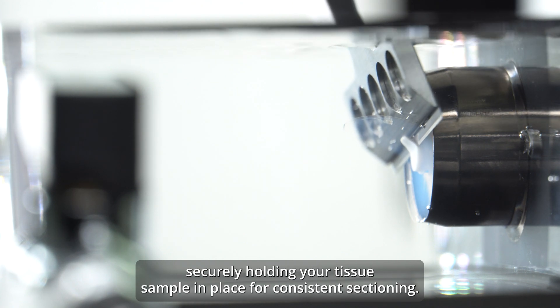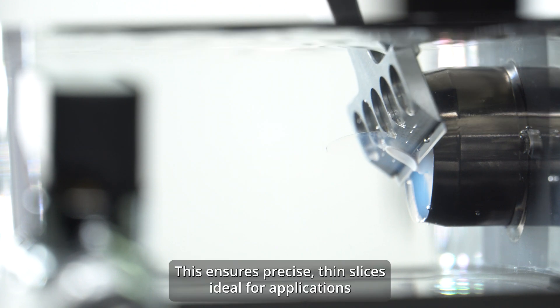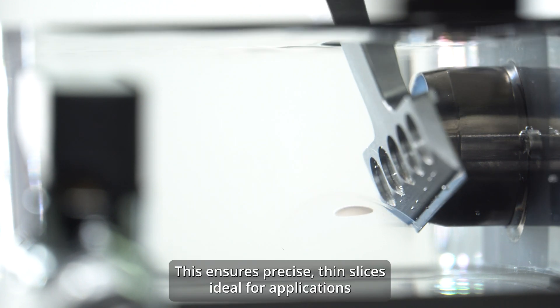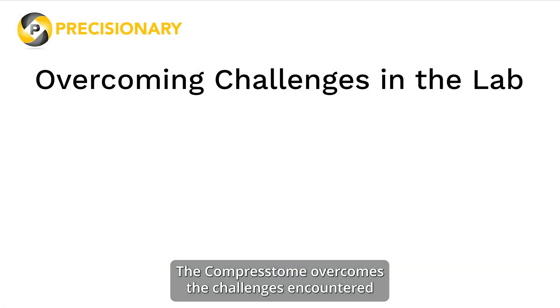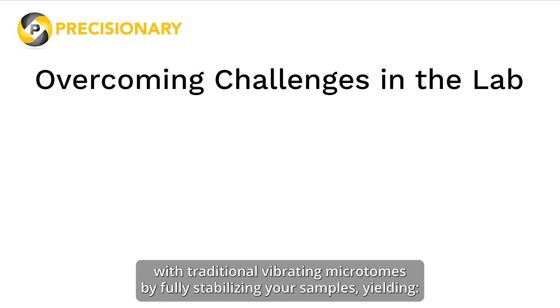This ensures precise thin slices ideal for applications such as imaging, electrophysiology, tissue culture, and more. The Compresstome overcomes the challenges encountered with traditional vibrating microtomes by fully stabilizing your samples, yielding smooth sections without vibration artifacts and chatter marks.